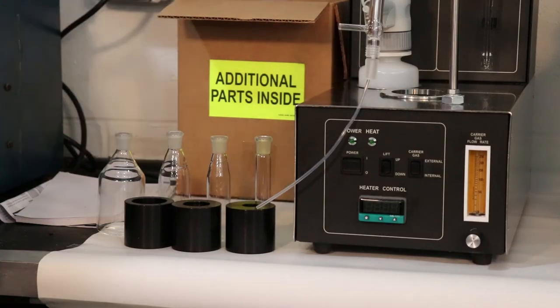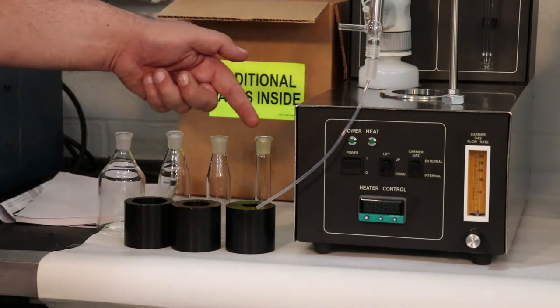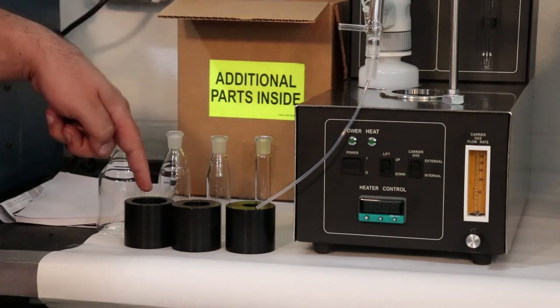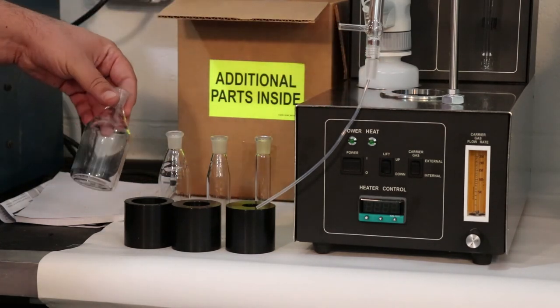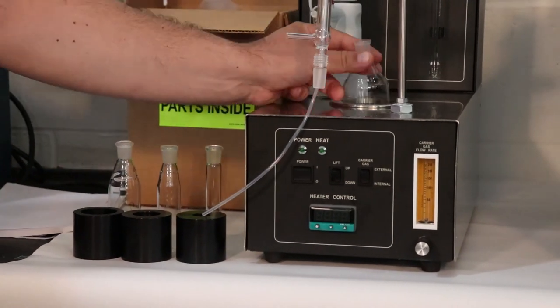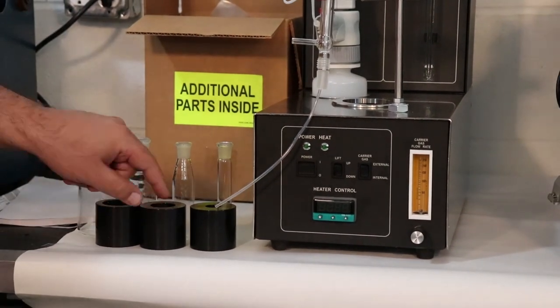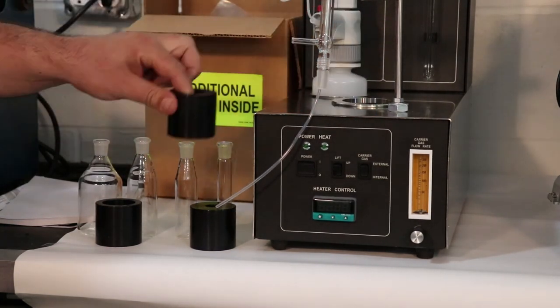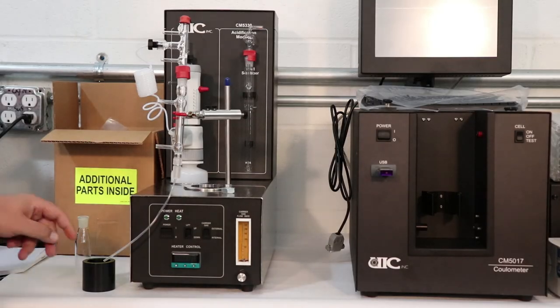There are four different types of sample flasks: 10, 25, 50, and 100 milliliter, with appropriate inserts for the heating block. 100 milliliter flasks do not need an insert; they are placed directly into the heating block. For this demonstration, we will use a 25 milliliter flask and insert. Place the insert in the heating block.